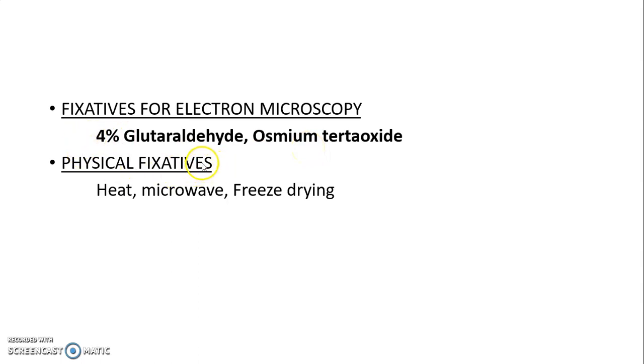Physical fixatives are heat, microwave, and freeze drying. So we can fix the tissue by heating, microwaving, or freezing.